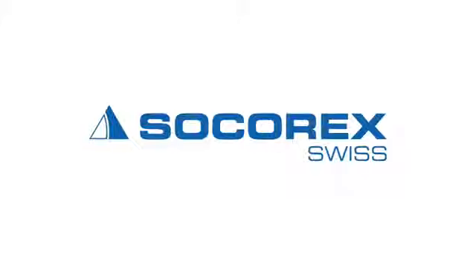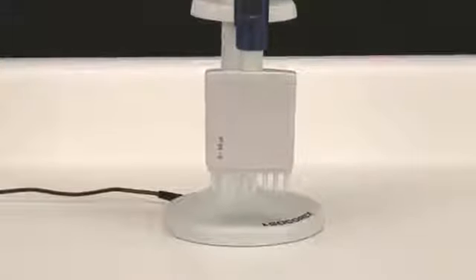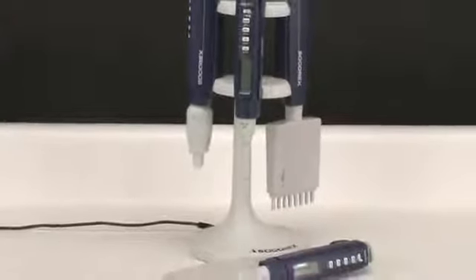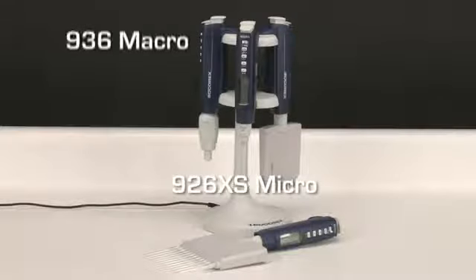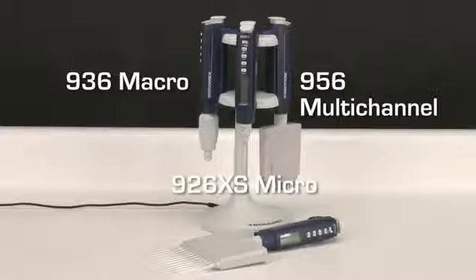Socorrex Acura Electro Pipettes. The Acura Electro series of microprocessor controlled pipettes from Socorrex offers a wide selection of high precision instruments to meet the exacting demands of almost any liquid handling application. The Electro series makes electronic pipetting in the lab more versatile, simpler, and safer than ever. The product line includes the 926 XS Micro, the 936 Macro, and the 956 Multi-Channel models.